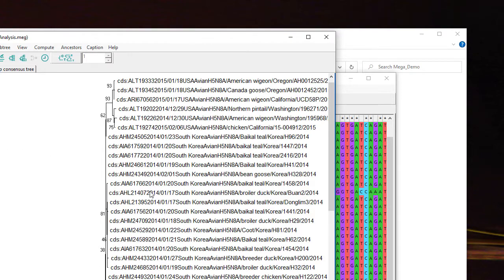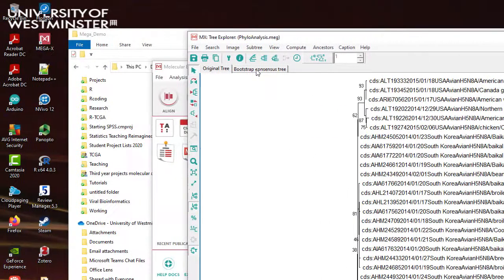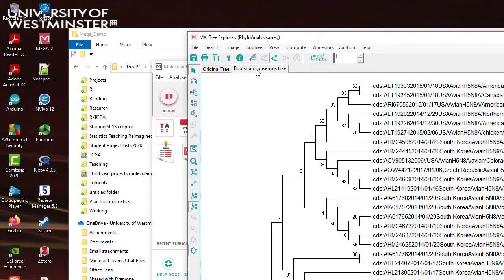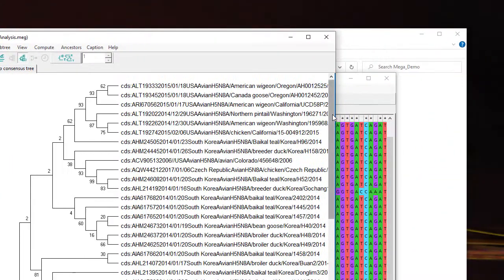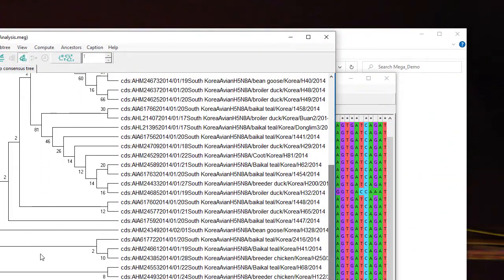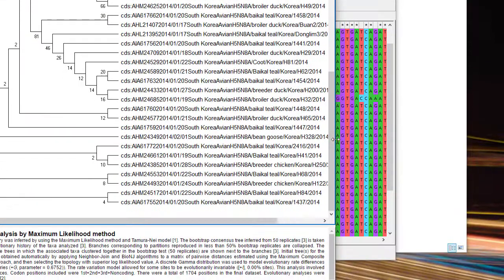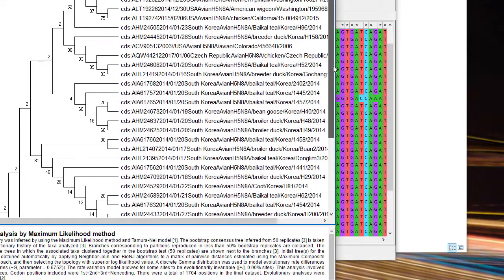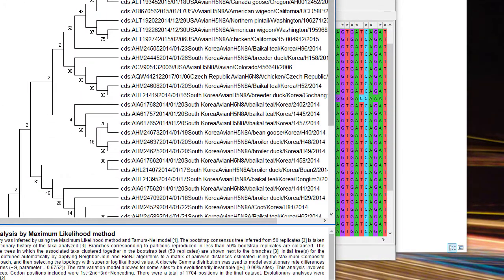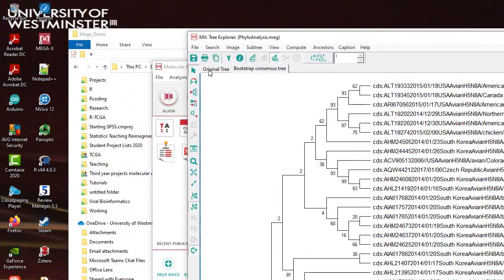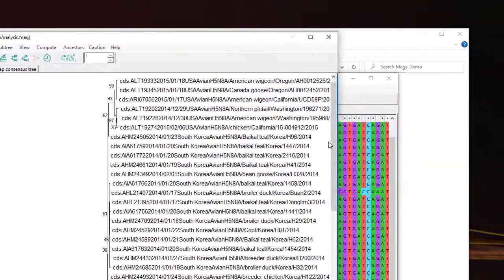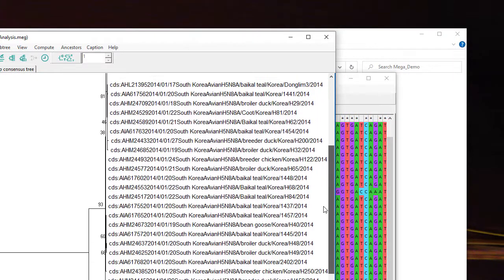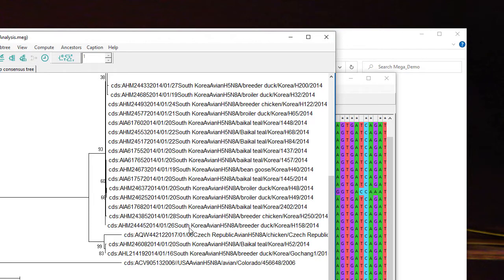As well as displaying it like that you can look at the bootstrap consensus tree which spreads it out a bit more clearly so you can see the bootstrap numbers so here you can see some very low numbers indeed so twos so very small probabilities but the original tree shows you the actual distances in terms of nucleotide changes so this is the tree that you want to report with the numbers on it.